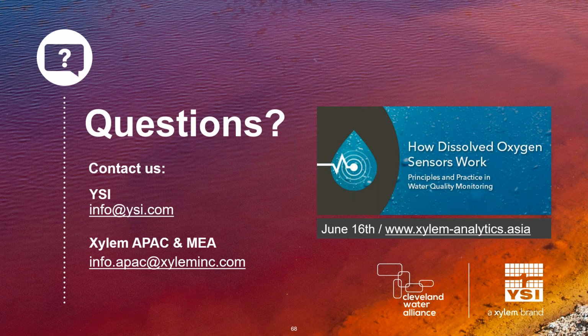On the topic of seawater, salt water, is there a calibration buffer for these applications? Nope, the salinity really doesn't matter in terms of pH. What really matters is just the total hydrogen ion content. So for salt water or for fresh water, even for a lab application, I would be calibrating in exactly the same way.